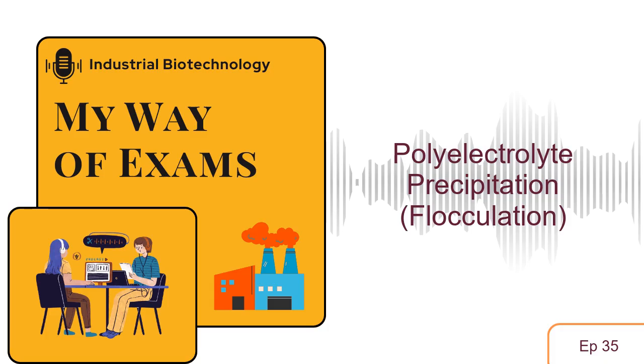Cool. So where would someone actually use this technique? What kind of applications are we talking about? Well, you'll see it a lot in biotech, like for removing cell mass after a fermentation process. Or clarifying fermentation broths, which can often be pretty cloudy. Basically, anytime you've got unwanted suspended solids in a liquid, this can be a good way to get rid of them. And this is often done as a sort of pre-treatment before more hardcore purification methods, right? Exactly. Which makes sense, given that it's downstream processing. Yeah, for sure. It's all about getting the bulk of the stuff out of the way early on.